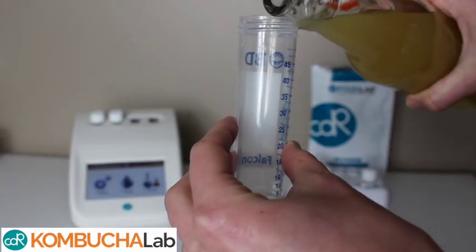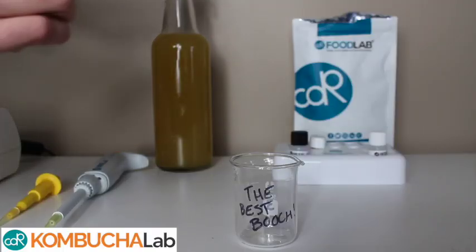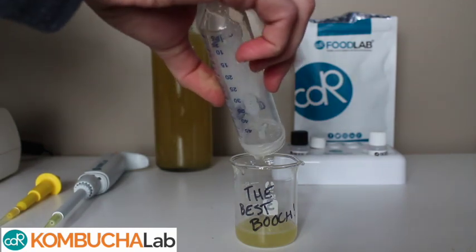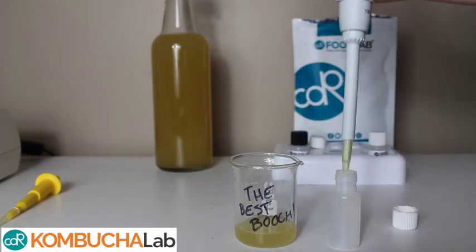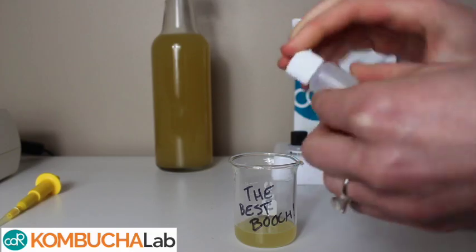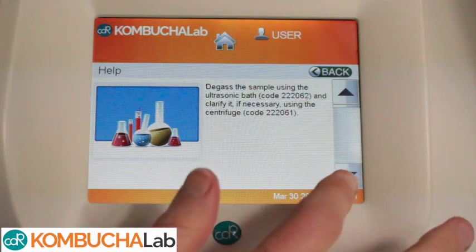To show you how the Kombucha Lab works, here is the process for testing the alcohol content of your kombucha. First, you'll want to de-gas your kombucha by shaking it, or by using an ultrasonic bath. Then you'll do a simple dilution and follow the instructions on the analyzer screen. Remember, there's always the help button to help walk you through the test step-by-step.